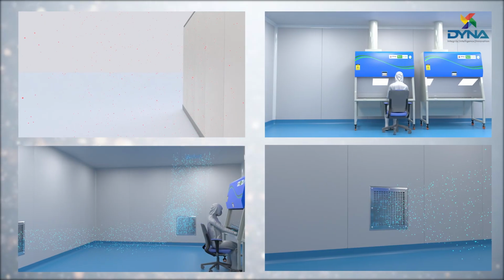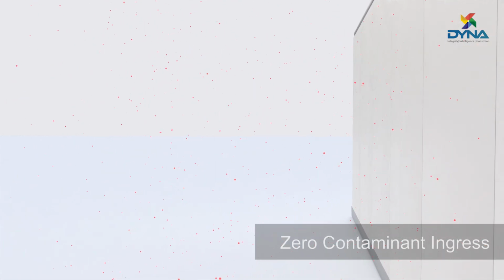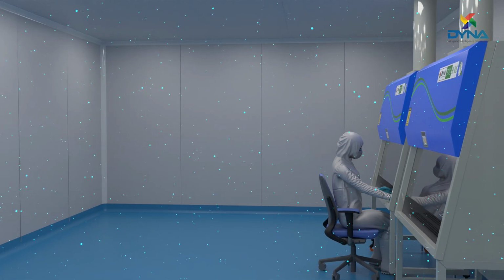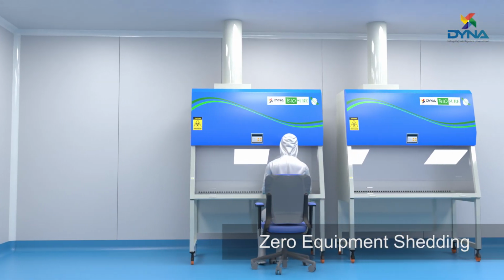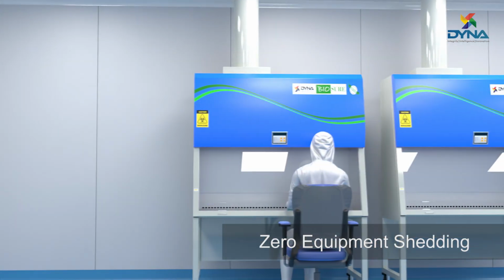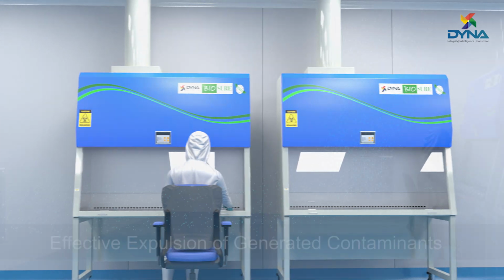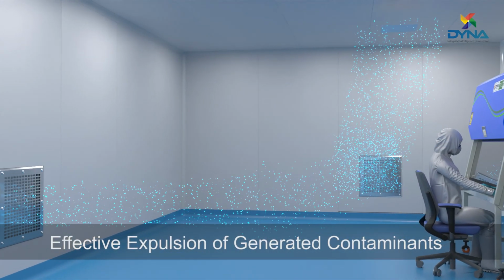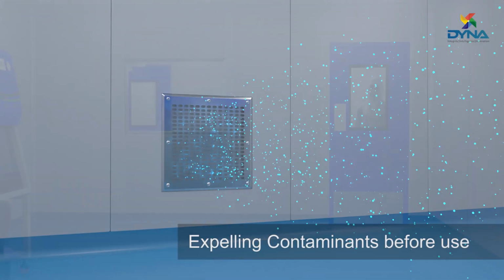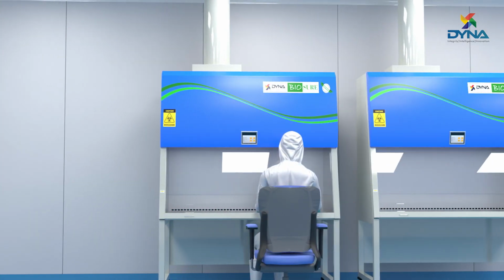There are 4 specified requirements of a cleanroom. First and foremost, there should be no entry of the contaminants from outside to inside. Secondly, the equipment present inside a cleanroom should not be a source of dust or other contaminants due to friction, chemical, or biological reactions. Third, there should be no accumulation of contaminants in the room. And fourth, the contaminants originally present in the room should have been eliminated to the greatest extent.